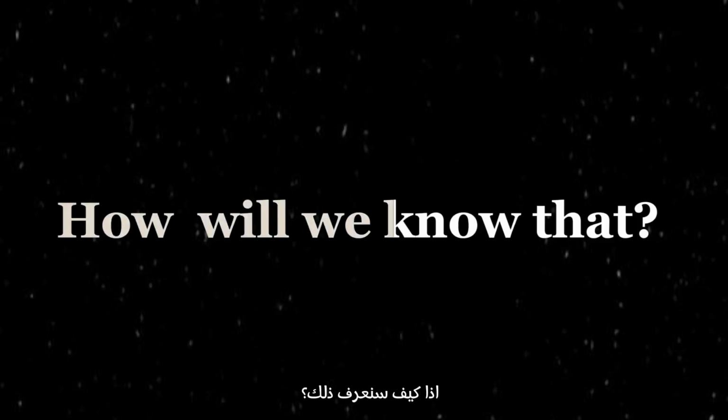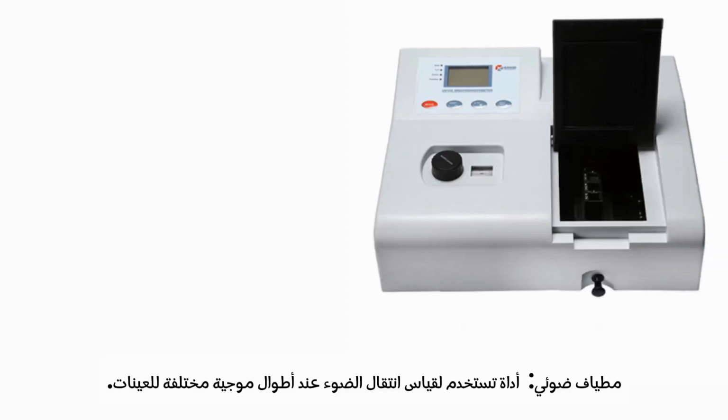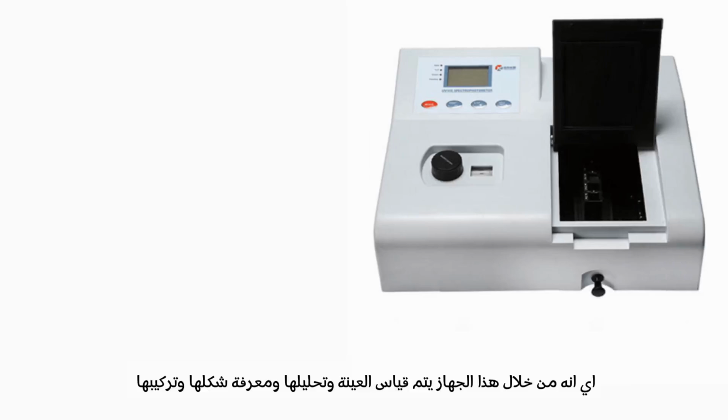The most important reason for making this video is the knowledge of the synthesis and formation of chemicals and medicines. So, how will we know that? The answer to this question will be through the use of spectrophotometers. First, we must know what a spectrophotometer means. It's an instrument used to measure the transmission of light at different wavelengths of a sample. So through a spectrophotometer, the sample is measured, analyzed, and its shape and composition are known.